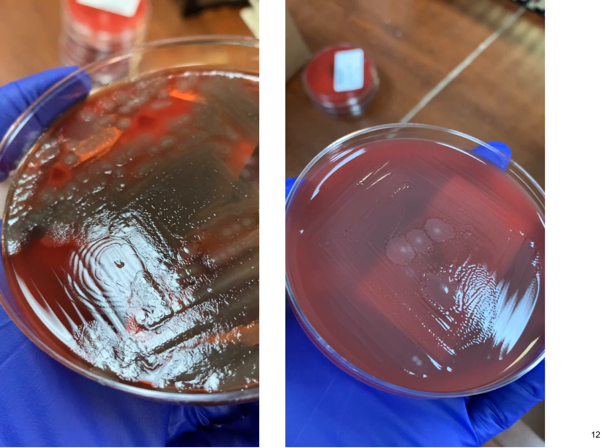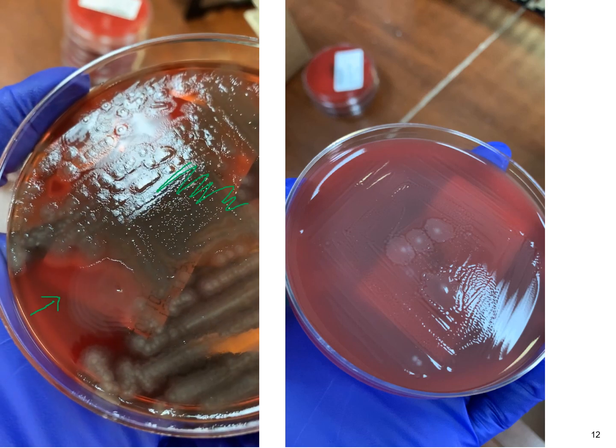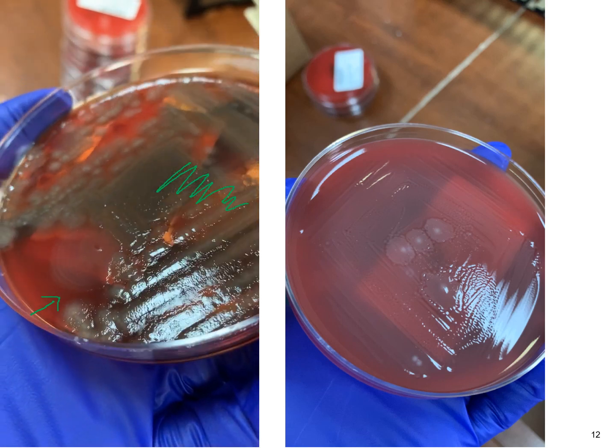Alright, so here we have something a little bit interesting. So out here in this portion we have the organism that we looked at that had that metallic sheen. But here at the bottom, I want you to kind of focus on this, if I can get this to play at the same time. And I want you to notice how it kind of swarms out. So it starts in a pattern and then it kind of swarms out. So you can see how it kind of has little ripples or waves in it.